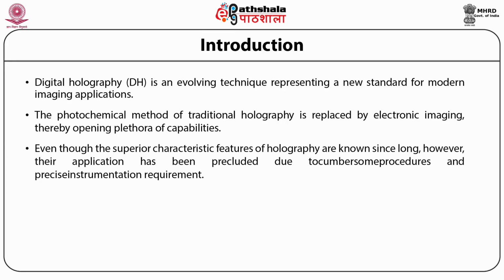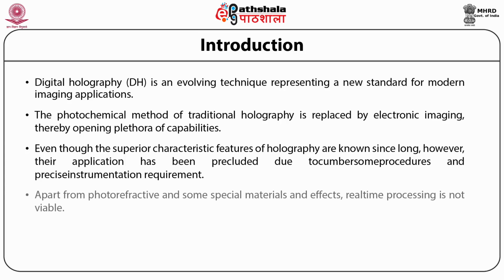Even though the superior characteristic features of holography have been known since long, their application has been precluded due to cumbersome procedures and precise instrumentation requirements. Apart from photorefractive and some special materials and effects, real-time processing is not viable.